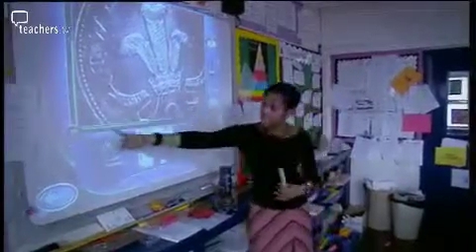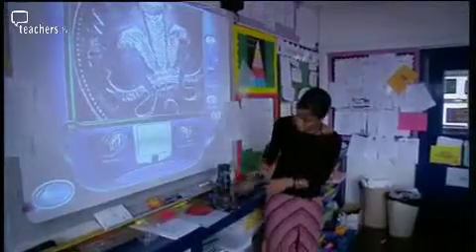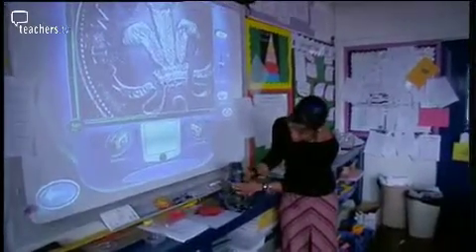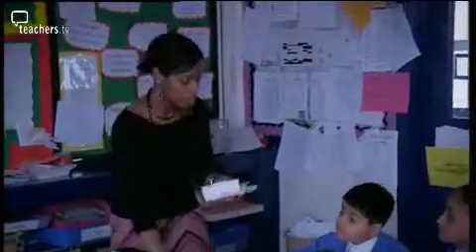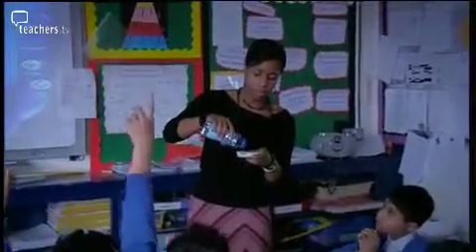to demonstrate magnification. That is actually, it's just been magnified 10 times. We're going to set up our cress seeds now. So we're going to use a Petri dish. Okay, you see these in CSI all the time. Yeah. The idea is for the cress seeds to germinate on the moist cotton wool.